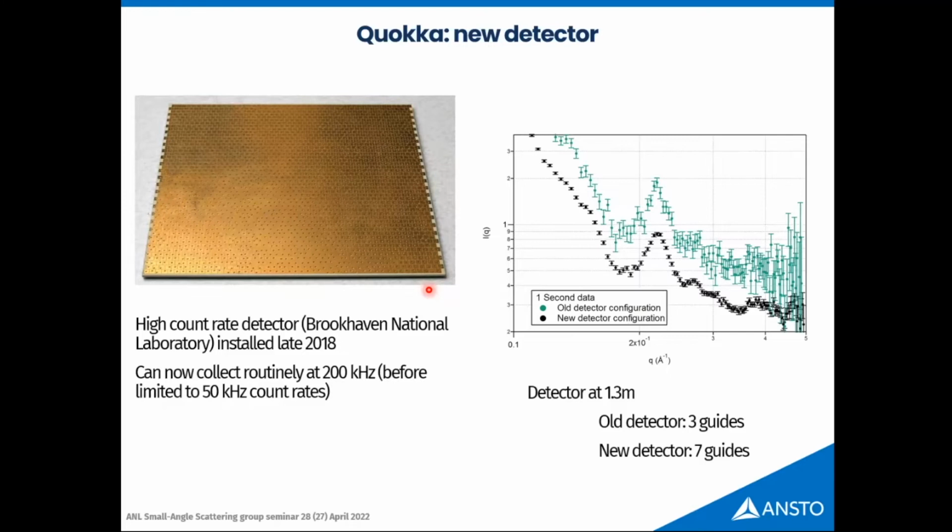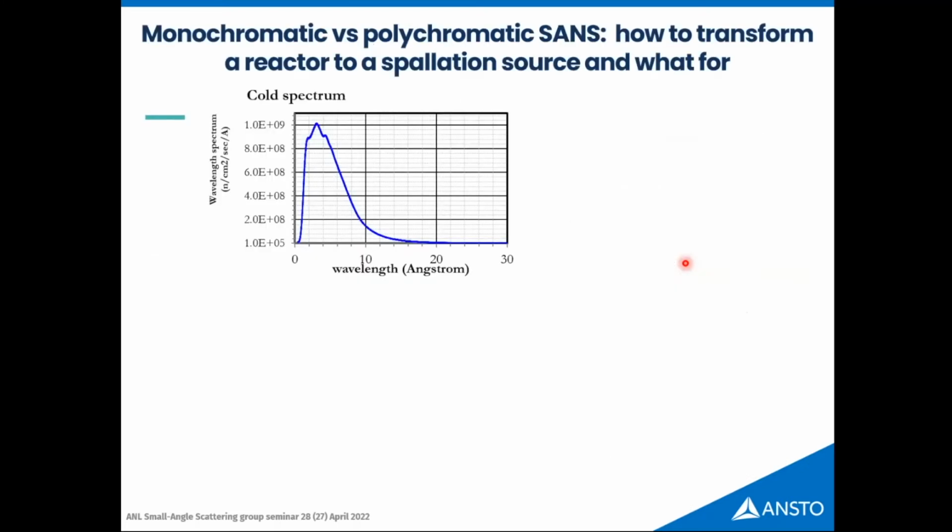I mean, spatial resolution is wonderful. And this detector can handle a lot of flux. This is an example of 1 second data, 10⁻⁵. So just like how great it behaves. So yeah. All right, fine.